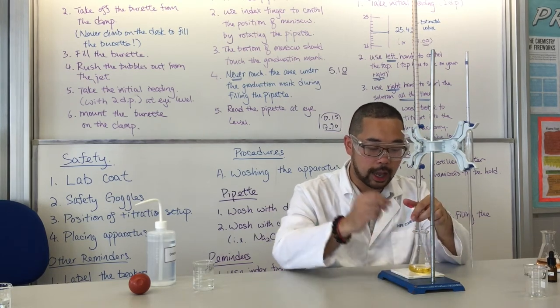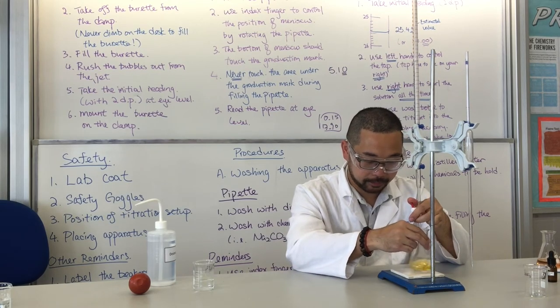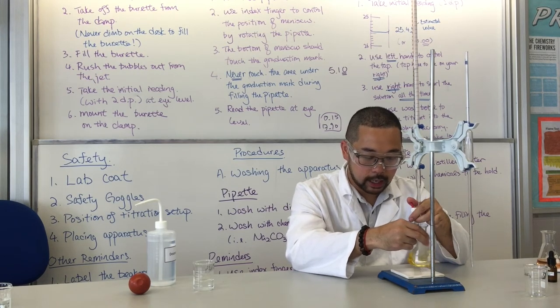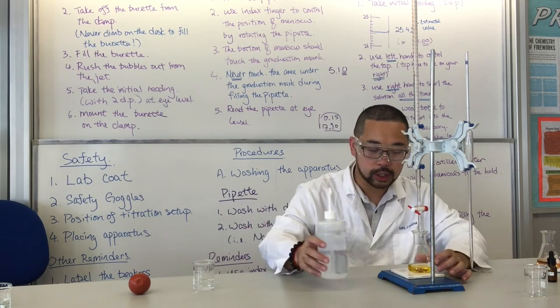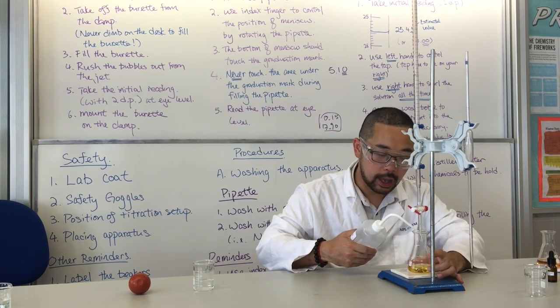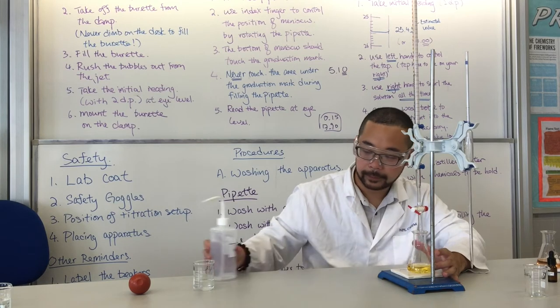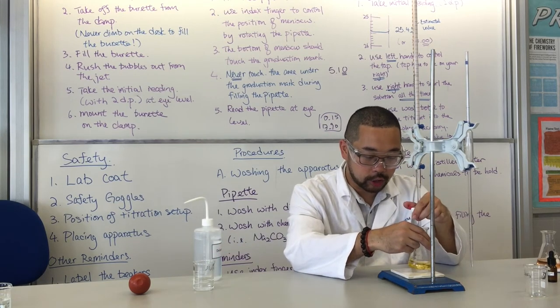So right now, we're going to add the solution into it. Sometimes the titrant may get onto the inner wall of the conical flask. When that happens, what you need to do is use deionized water from the wash bottle. You have to rinse the solution into the conical flask. After that, you can continue the titration.